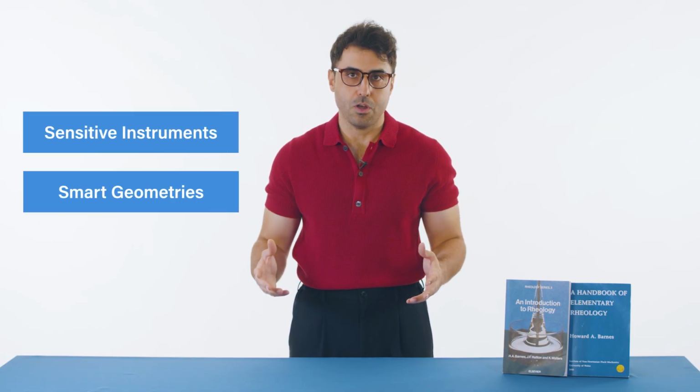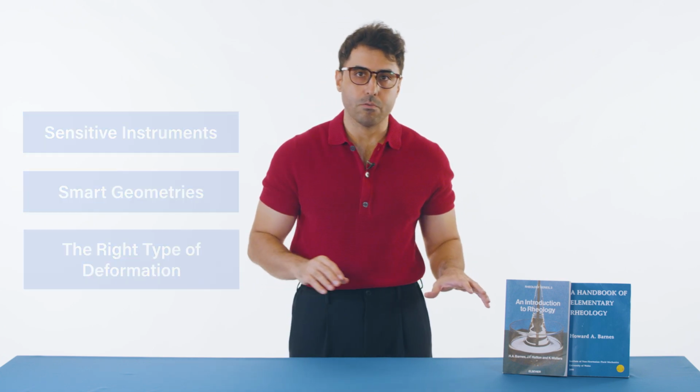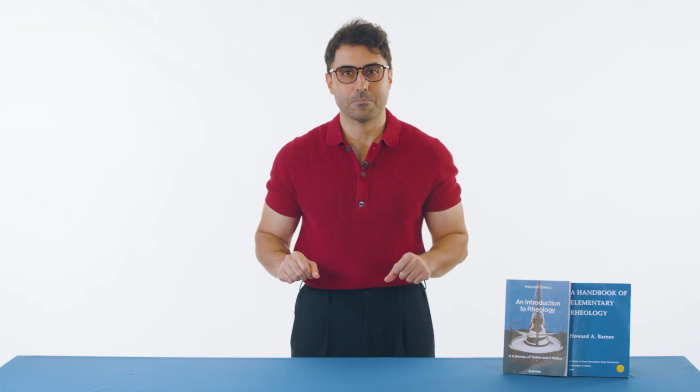So to characterize complex fluids, including measuring their viscoelasticity, we need three key things: sensitive instruments, smart geometries, and the right type of deformation. Each part of the rheometer and rheometry, from the torque transducer to the geometry to the test mode, plays a role in helping us understand how materials behave. In the next episode, we'll explore how we actually run these rheometry tests.